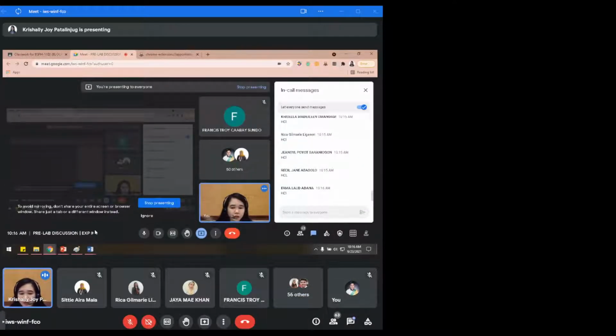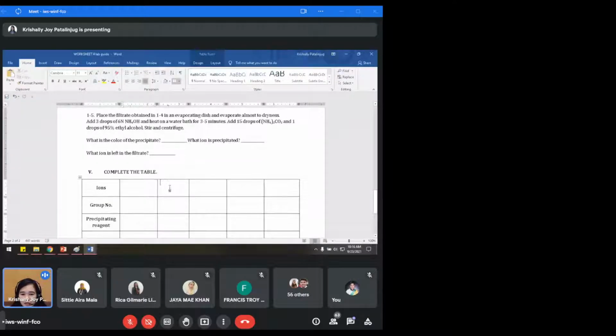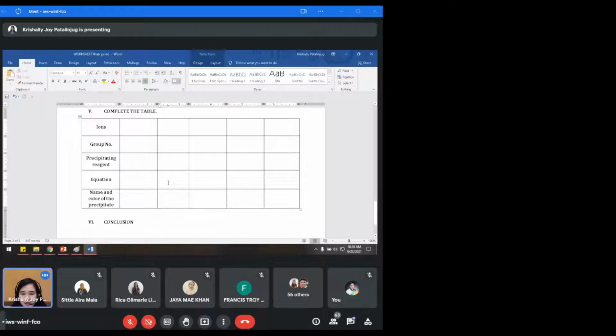Very good. Kung copper, ang next is copper ion, Cu2+. Ano yung test solution na ginamit natin dito sa equation na to? Cupric sulfate.